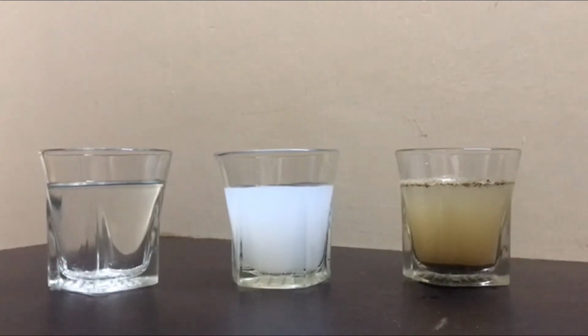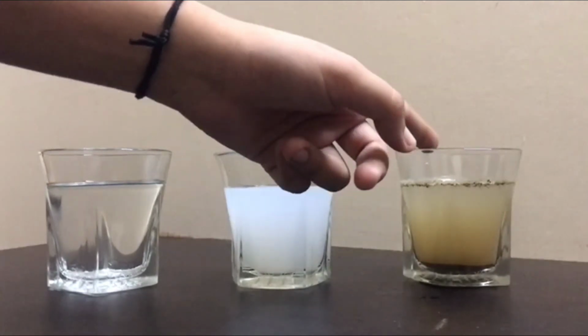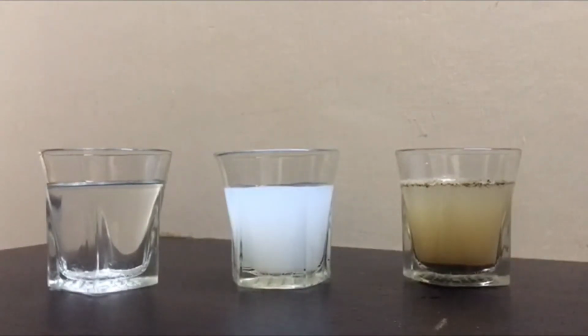Finally, let's look at this third beaker. It's soil mixed with water, a perfect example of a suspension. The particles are much larger than in the other two mixtures, and if left alone, they would settle to the bottom.